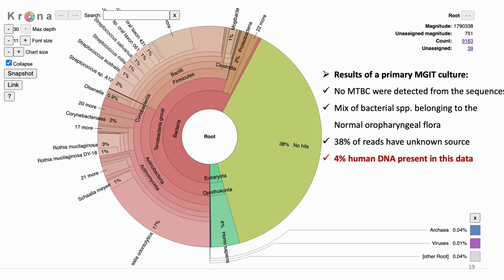So we don't have any information from this microorganism or organism in RefSeq, so Kraken cannot assign any classification for these reads. So in general, we consider this sequencing file of bad quality and without detection of Mycobacterium tuberculosis, even at 1% in this FASTQ file.